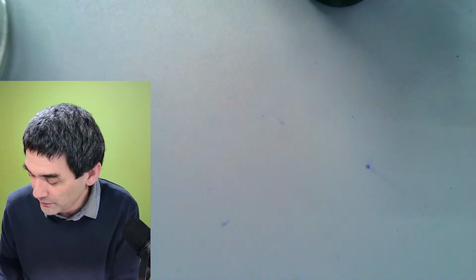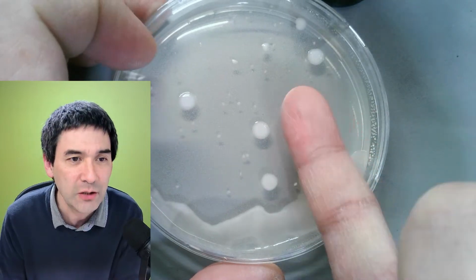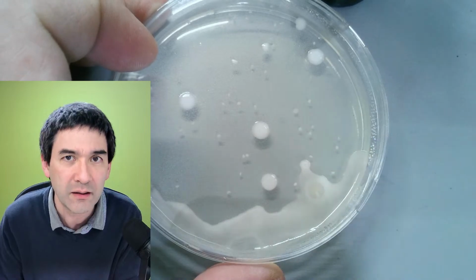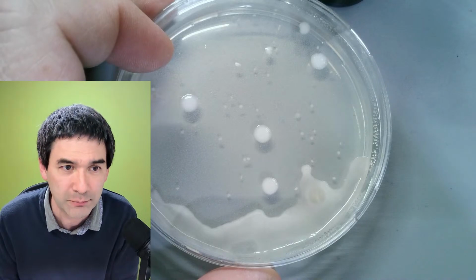Okay, and you see over here as well. Yeah, and those tiny colonies that you see here, those tiny dots here in the background, they're not on the surface. They are actually inside the growth medium because it didn't disinfect properly, okay?